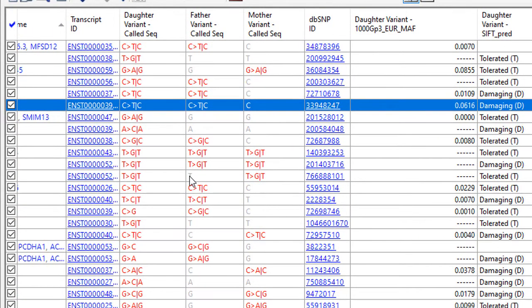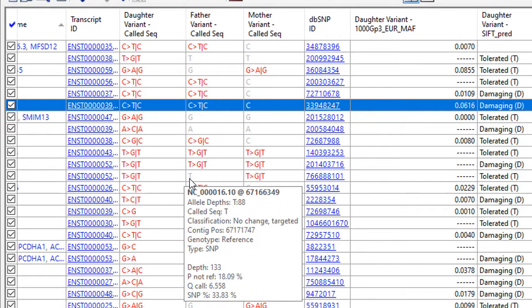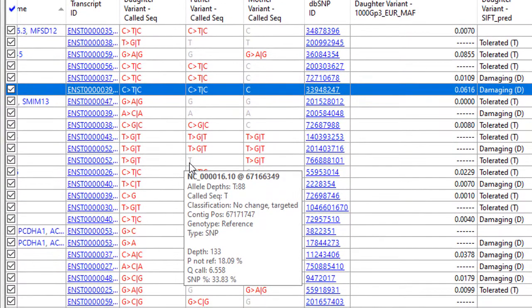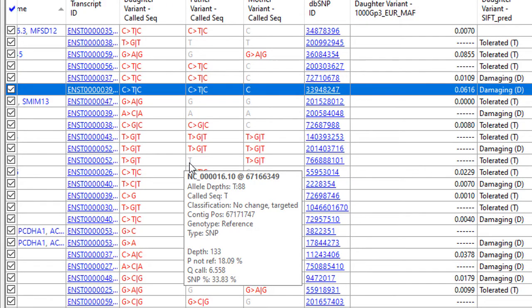Note, in the called sequence, you can hover over a base call to see information about the assembly, including depth and quality score. This helps you distinguish between missing SNPs where there was no coverage and areas where there's coverage but no SNP.